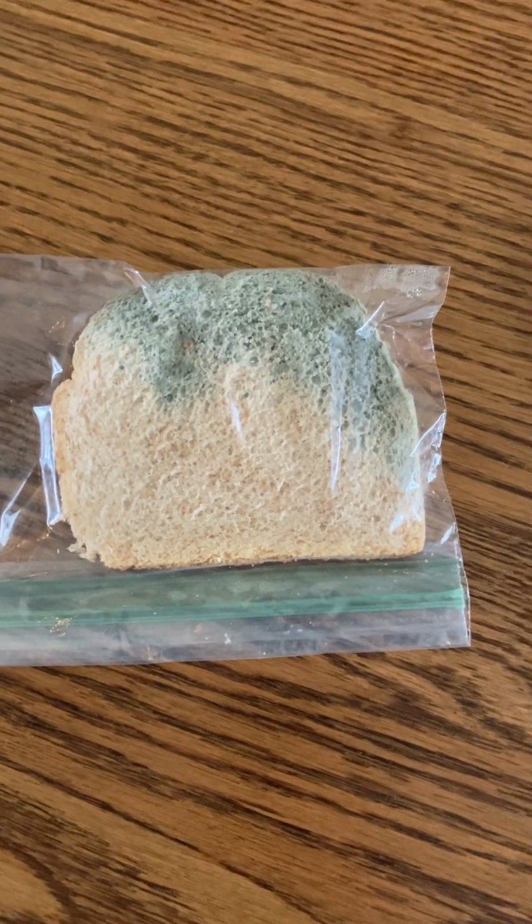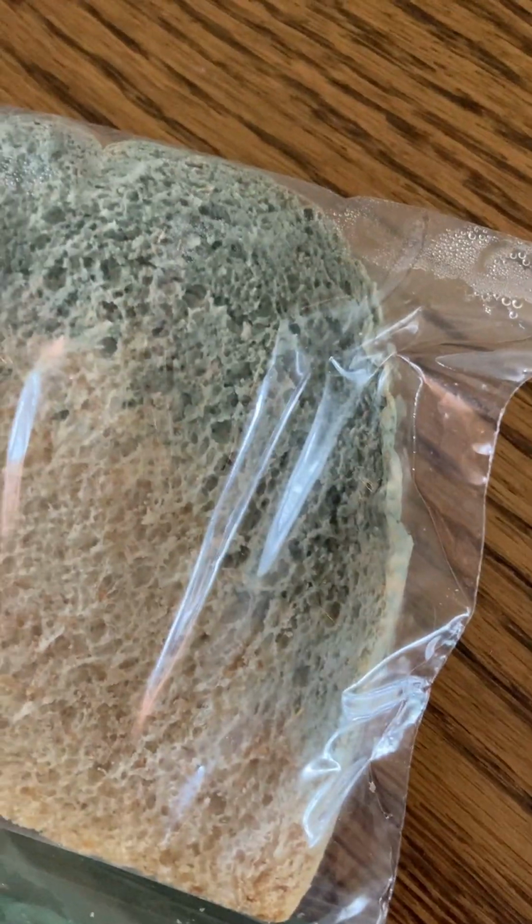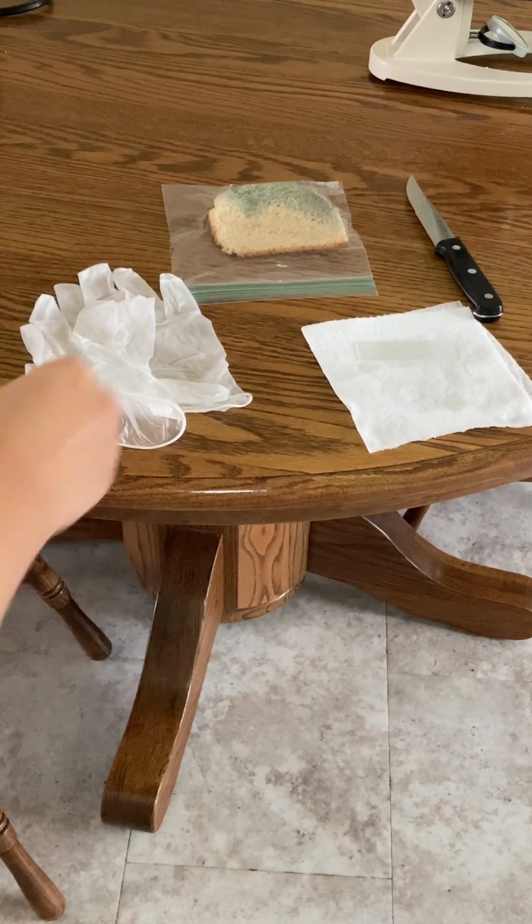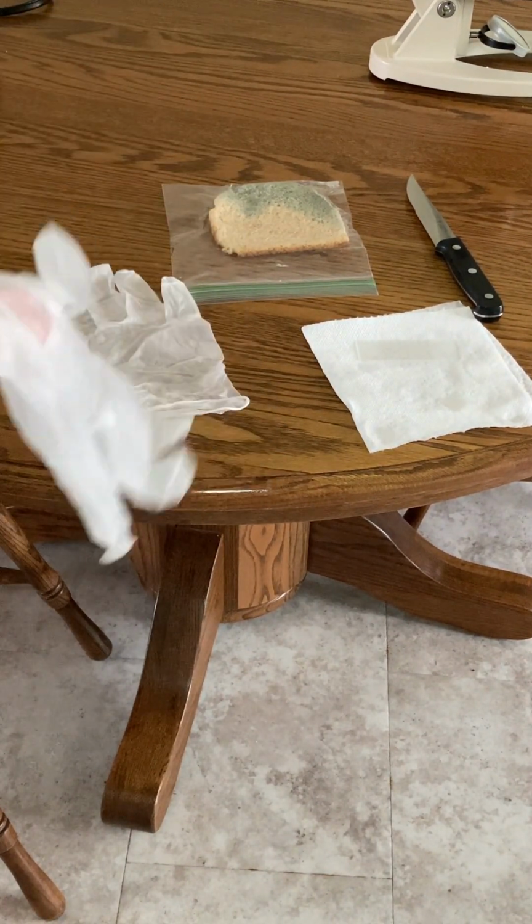Next, we're going to look at mold. I've grown some mold on a slice of bread by putting several drops of water on the bread and then sealing it in a plastic bag and leaving it on a sunny windowsill for a few days. You could also grow mold on a piece of fruit or a vegetable easily using a similar method. If you are doing this lab at home, be sure to use gloves and wash your hands really well after handling the mold.